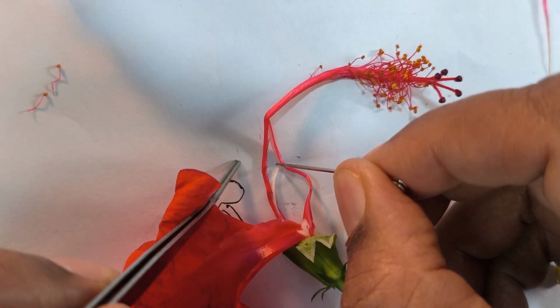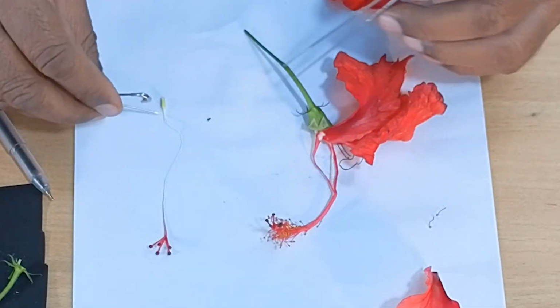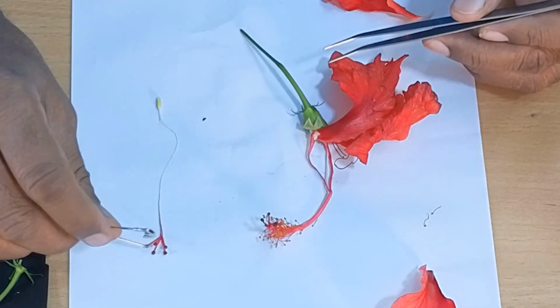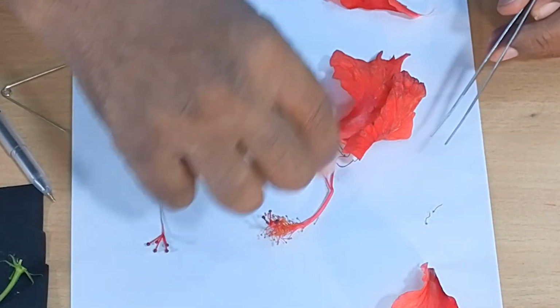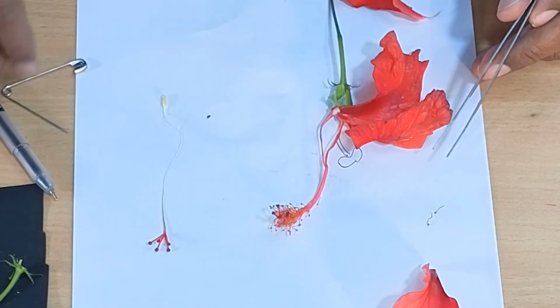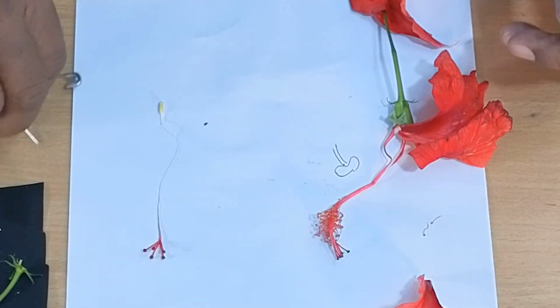For your benefit, I have removed this, and you can see this. So ovary, style, and then you have stigma. This style is passing through the staminal tube, which is formed when all the filaments are joined together. So this is a unique feature of this Malvaceae family.